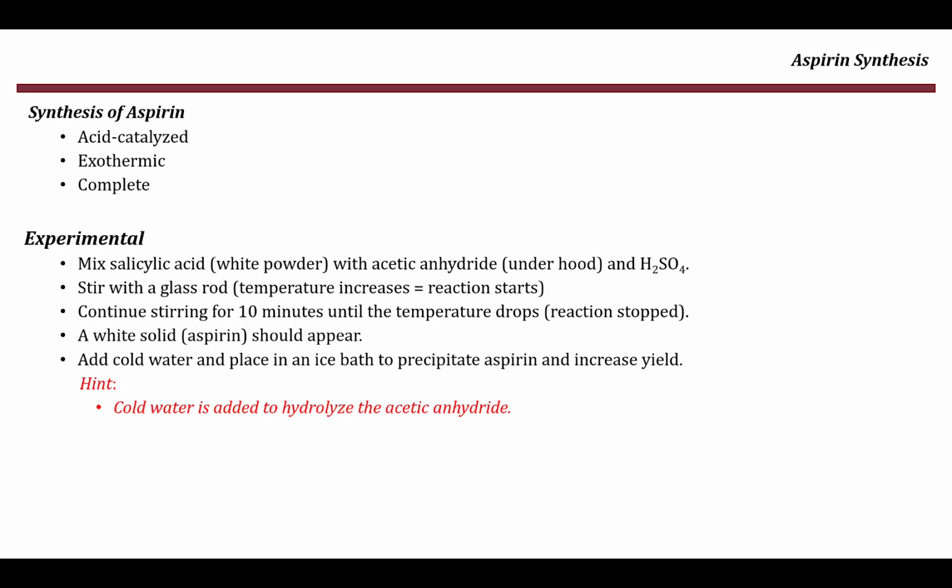We have to be careful because adding cold water is also used to hydrolyze acetic anhydride. So there are two main reasons for using cold water. The first one is to precipitate aspirin, and the second one is to hydrolyze acetic anhydride, which is used in excess. If we used hot water, it will cause hydrolysis of aspirin. As I said before, hydrolysis is breaking of the ester group and forming the salicylic acid back.